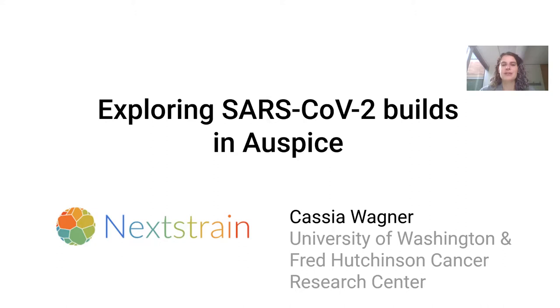Hello! My name is Katia and I'm part of the Nextstrain team. Today I'll be doing a demonstration to show you how to explore SARS-CoV-2 builds for trees in Auspice, which is the visualization software behind Nextstrain. In this demo I'll be using a Washington State-focused SARS-CoV-2 tree, but I'm hoping that the info I share will be applicable for exploring your own SARS-CoV-2 builds or really any other Nextstrain pathogen build.